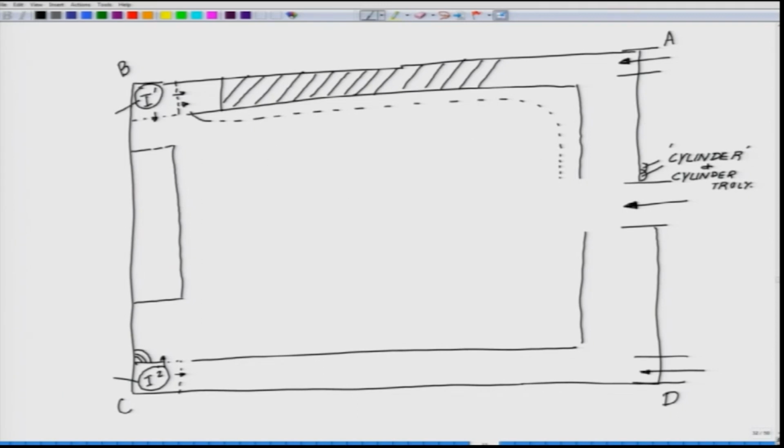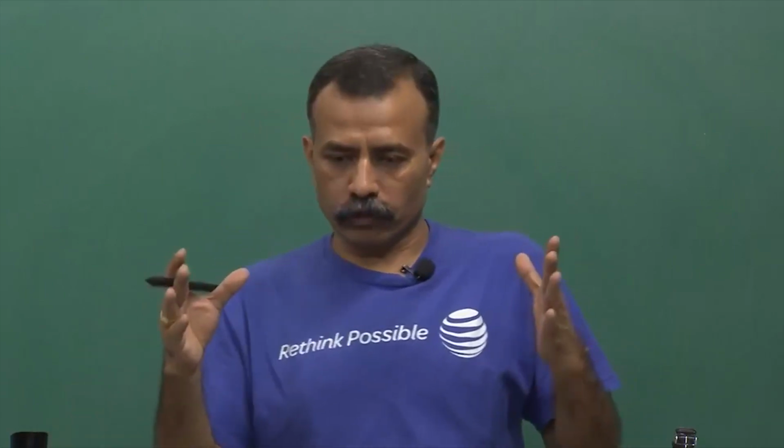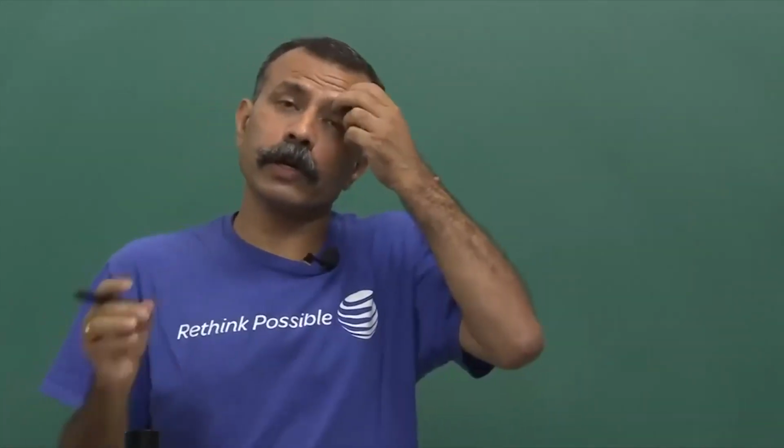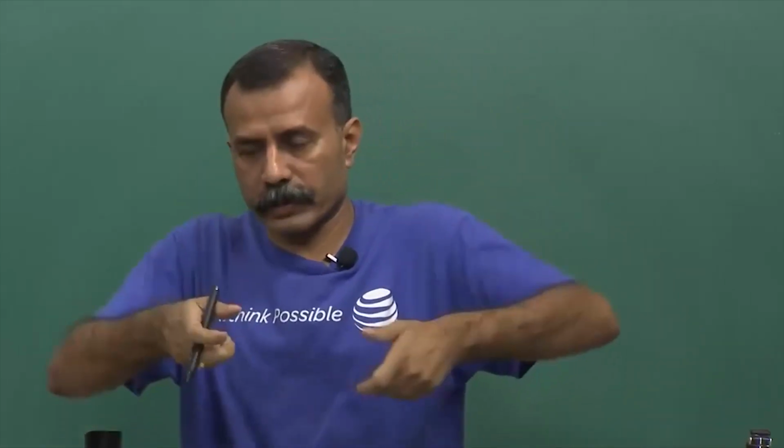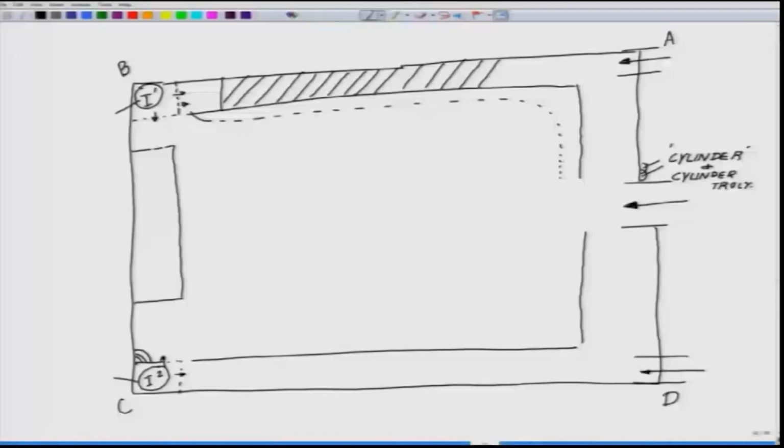Then I told you that you will be having a nitrogen dewar. You should have 2 nitrogen dewars, one to store the cell lines, the other to bring the liquid nitrogen, because you cannot carry the parent stock every time. You have to have a space, because every day you have to replenish nitrogen. So, you have to figure out where you want to put the nitrogen storage.